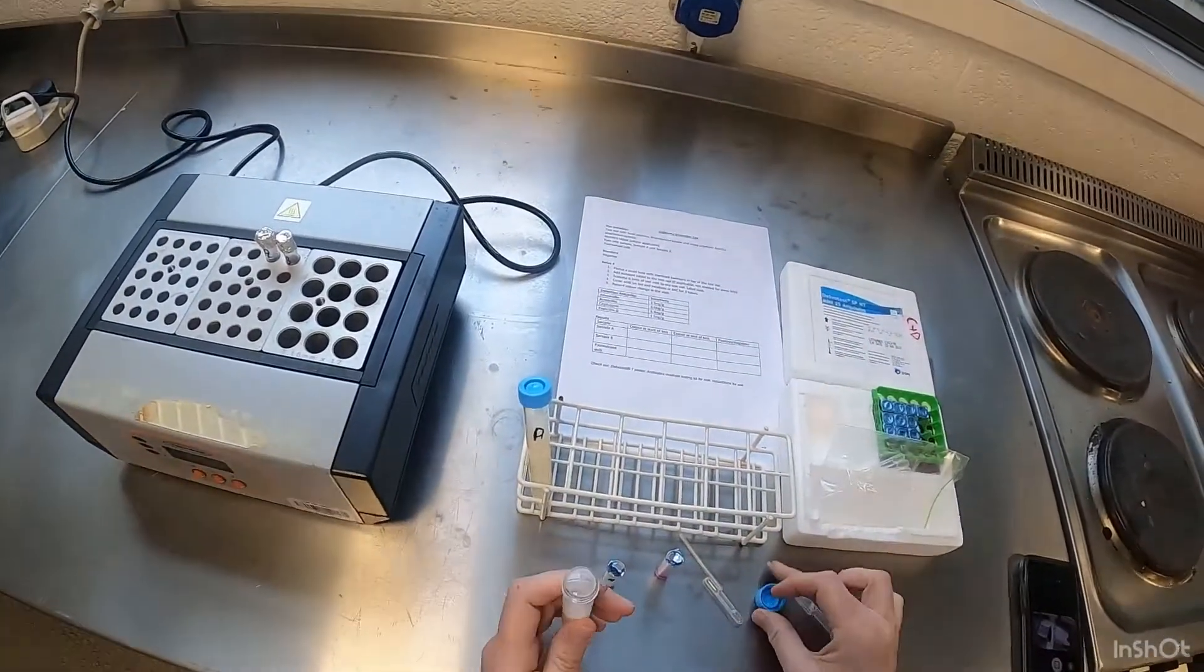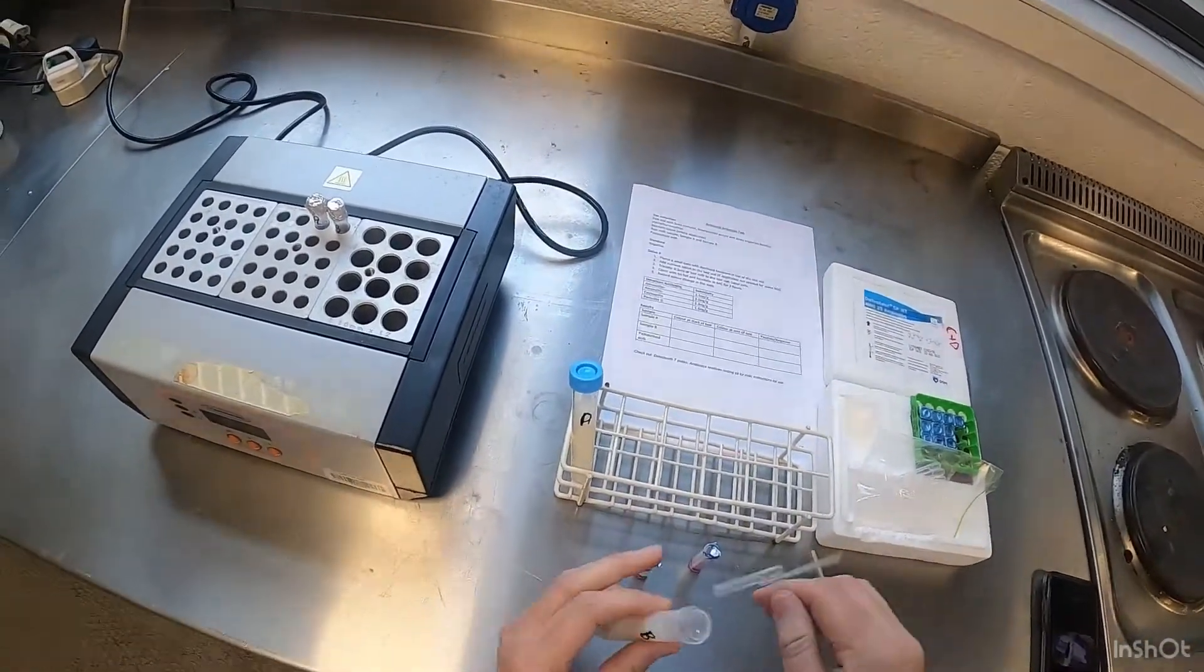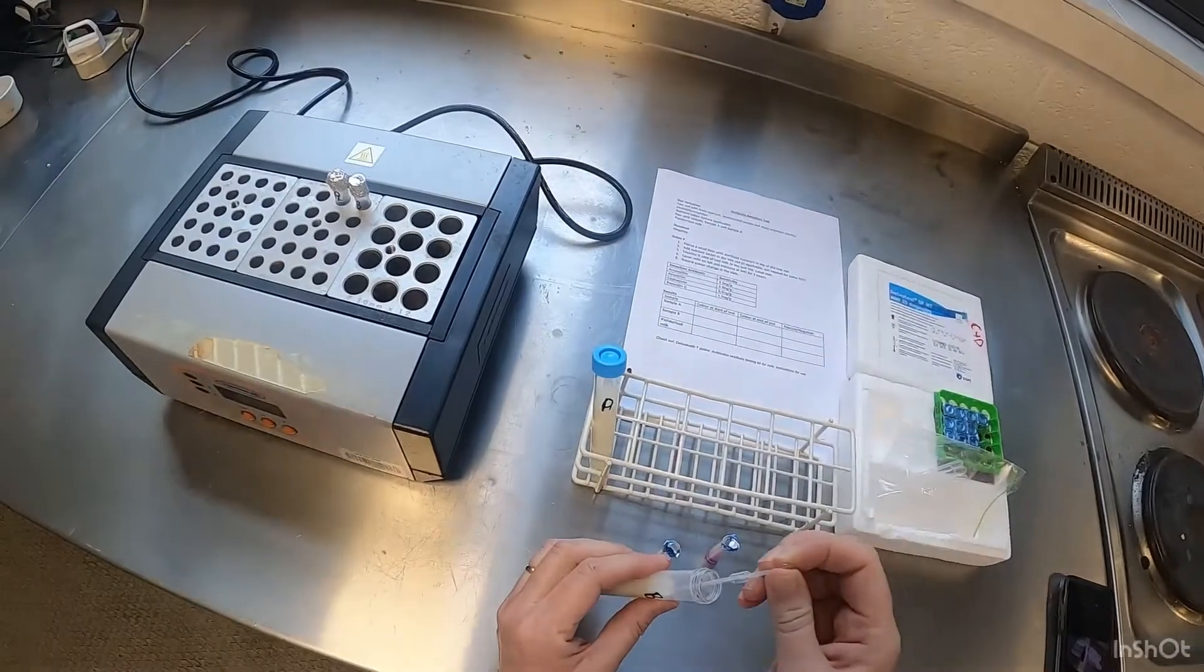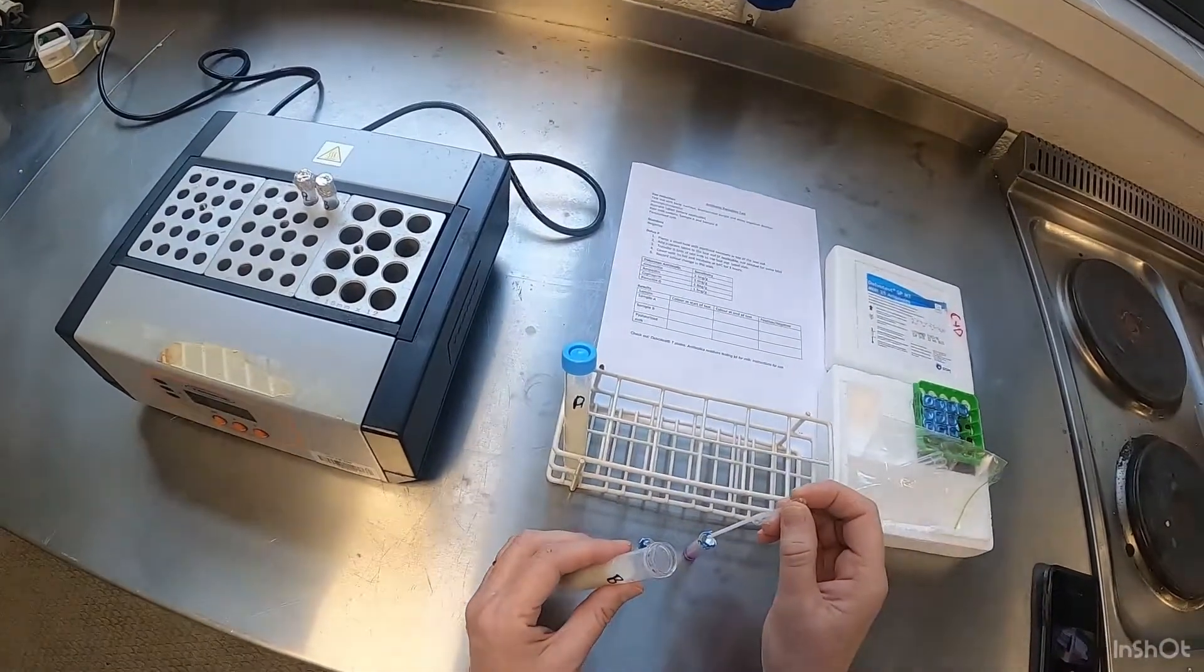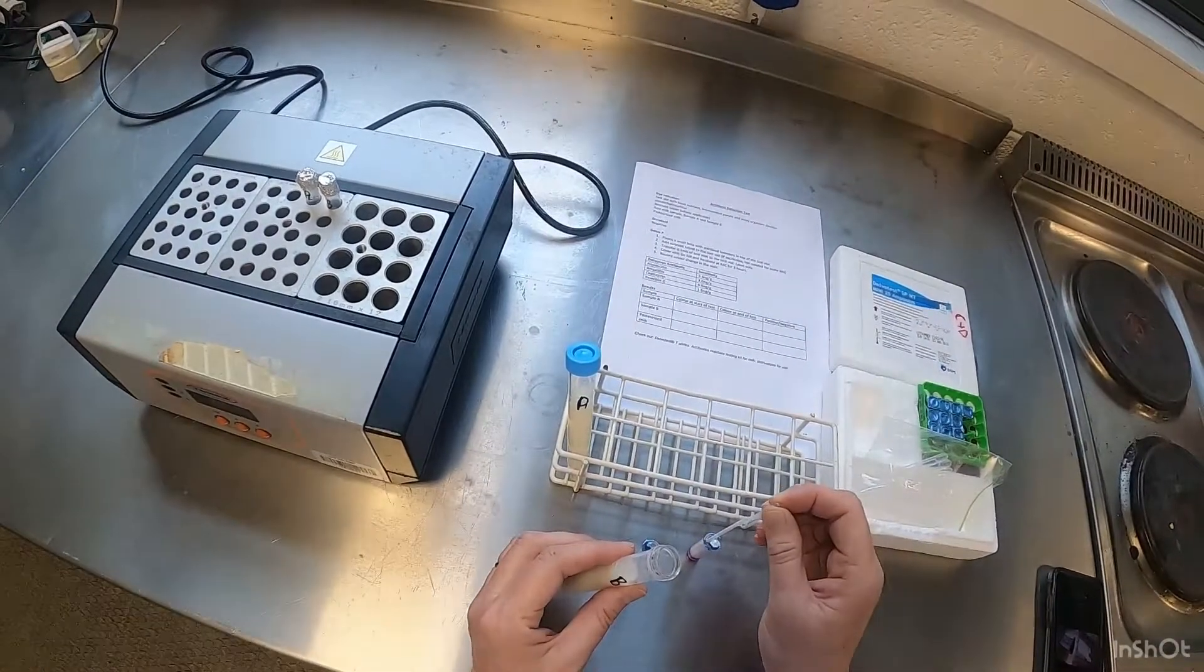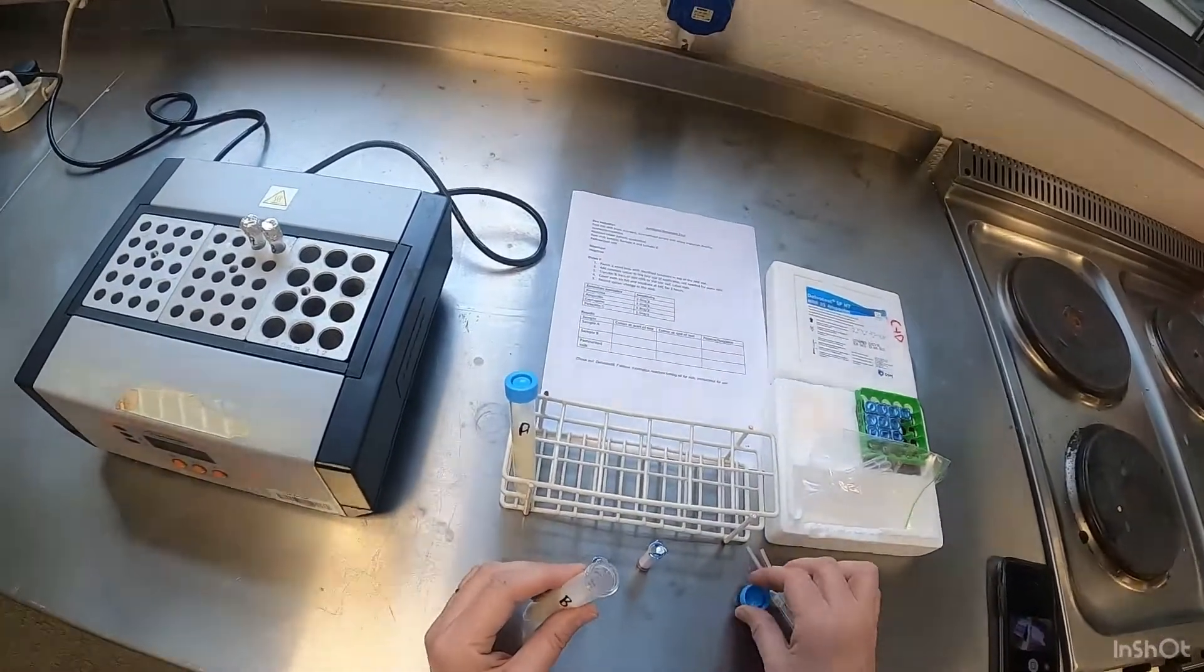Sample B. I'm going to use a different pipette for that because we don't want any cross-contamination. Again, I'm just going to lift a sample of that, place it into our ampoule as such.